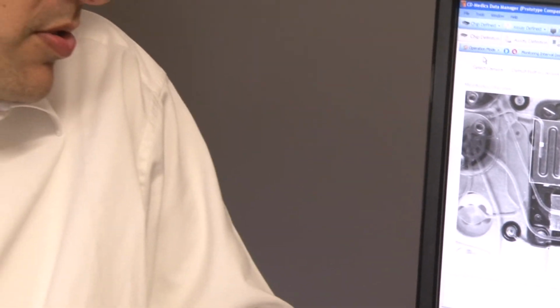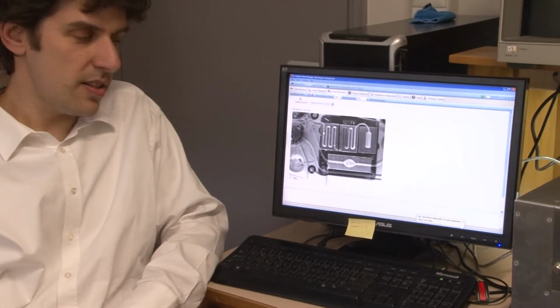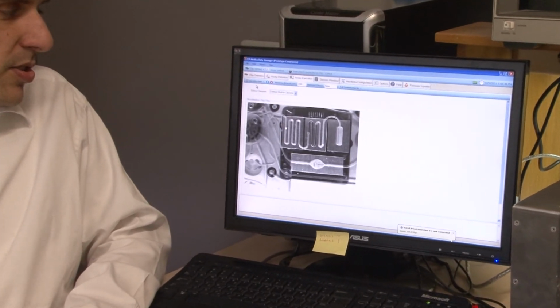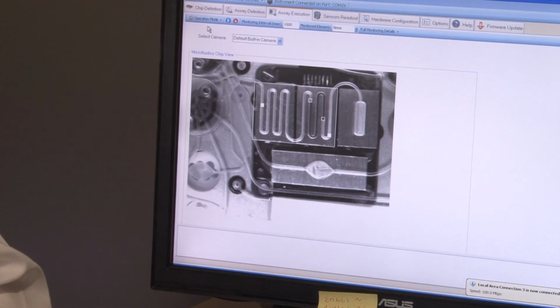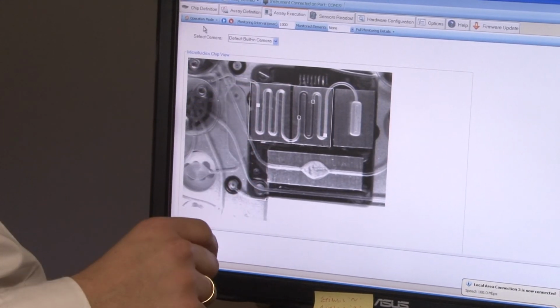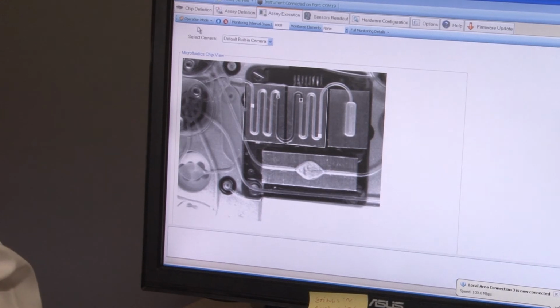This was introduced by a partner in the project, IMM, and you see here an implementation where the control of this oscillating PCR takes place with the help of the camera. 2 alarm points are positioned at the ends of this meandric structure, and every time the fluid reaches one of these ends, the control stops the fluidic motion and returns the fluids back. You have here a low temperature zone, approximately 60 degrees, and a high temperature zone, 90 to 95 degrees.